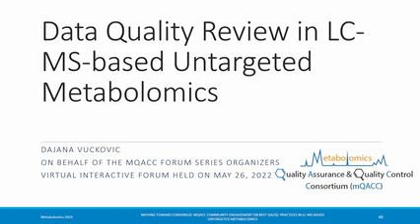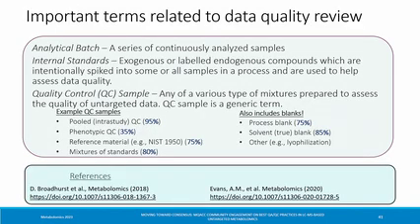Okay, good morning, everybody. So we'll switch gears a little bit and talk about the results from our interactive forum on data quality review. So just before I start showing you some of the results from this forum, I want to define a couple of terms that we defined for this forum. So we defined analytical batch as a series of continuously analyzed samples. We defined internal standards as exogenous or endogenously labeled compounds that we are adding in order to evaluate quality.